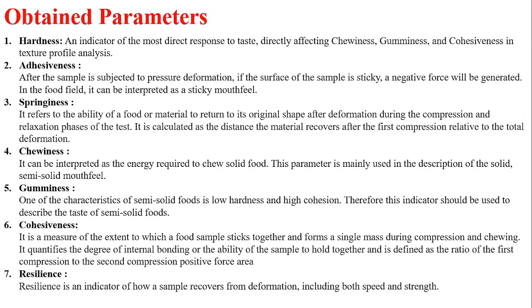Gumminess is also one of the characteristics of semi-solid foods. This is the characteristic of the food material which has low hardness and high cohesion. Therefore, this indicator is used to describe the taste of semi-solid foods.